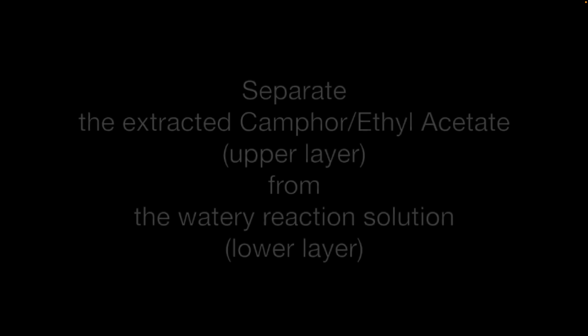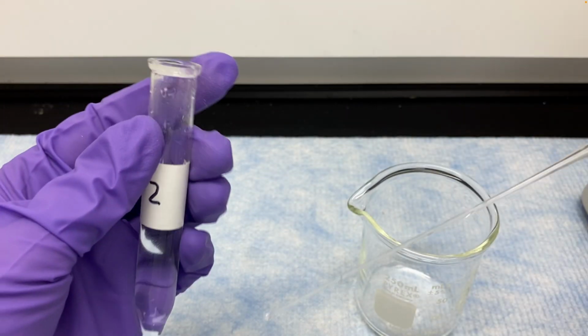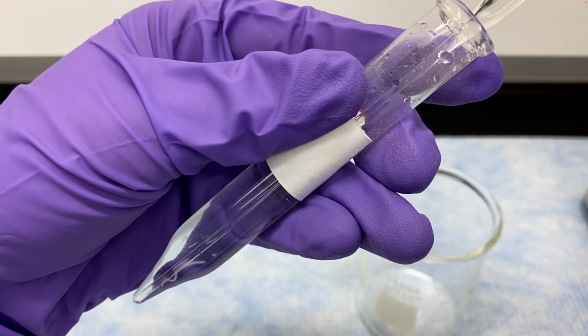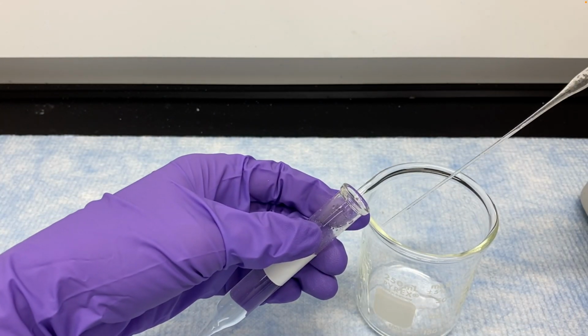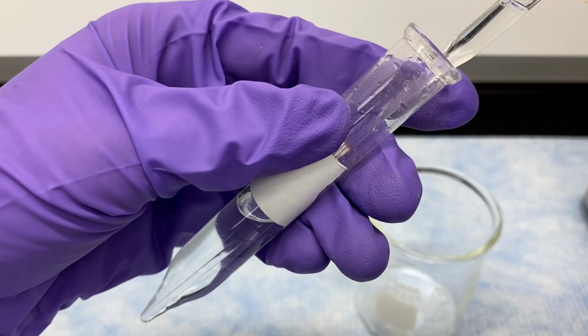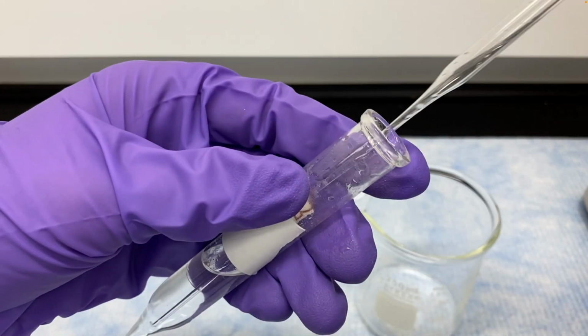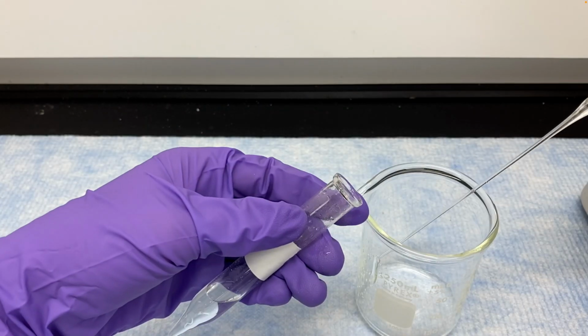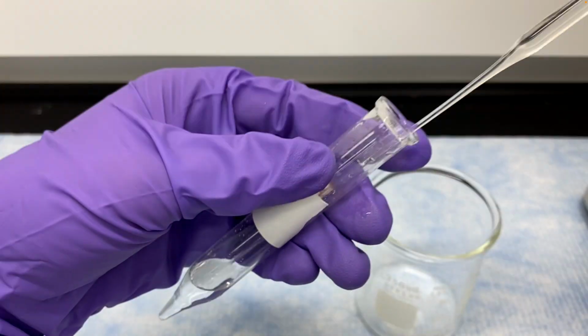The water is now just going to be waste. We've really taken all the camphor out of that. So we're just going to put it in a 250 milliliter beaker, which is just a waste beaker. Notice, you really want to squeeze the pipette bulb before you put this in, because if you get bubbles here, it's going to disrupt the separation between your two layers. So as those two layers get close, make sure you're putting the tip at the very bottom so you can control exactly how much you have.